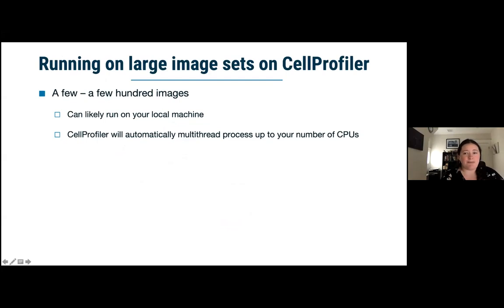Once you've created your pipeline and you've added, hopefully, as many measurements as you practicably can, you can run large image sets on CellProfiler no matter what your personal definition of large image sets is. As was mentioned in my intro, we collaborate with, on average, about 30 different groups a year, and everyone says that their image set is big, and everybody's image set is, of course, of a wildly different size. So if your definition of big is a few hundred images, you can probably run this on your local machine.